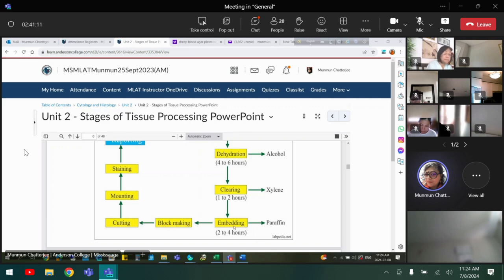It's liquid paraffin. Then you put the tissue in, and the tissue is secured, and it can be easy. It's soft at the time, but at the same time it's hard, so that you can use a very fine, sharp-edged knife to cut the tissue. Then you are going to make a block after the embedding. Embedding is not uniform, right?